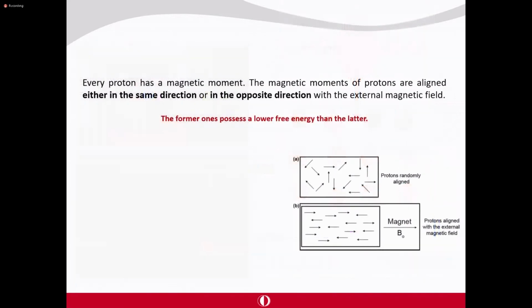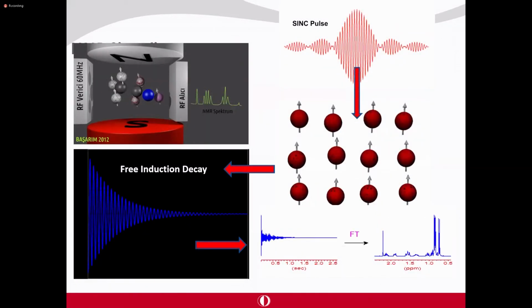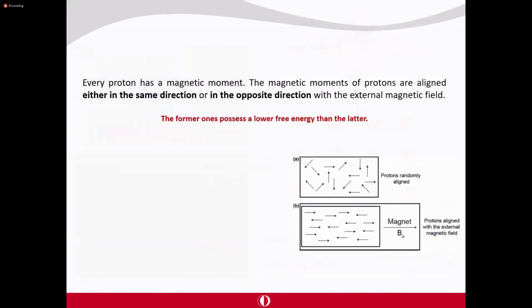Let me show you this video. So you see, currently the spins are precessing with a certain frequency, and this frequency is corresponding to the frequency of the system.